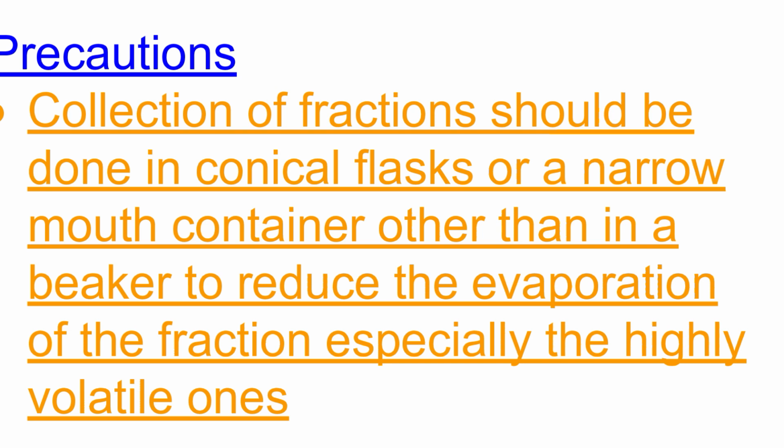So whenever you're performing this fractional distillation, ensure the receiving container has a narrow mouth to prevent loss of the product by evaporation, especially those which are very volatile, like ethanol.